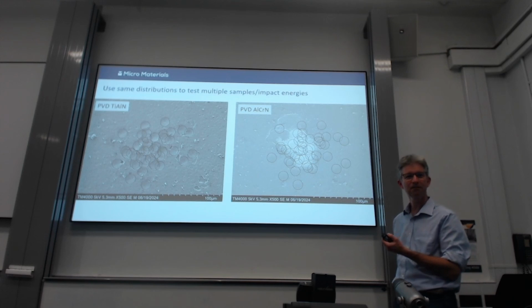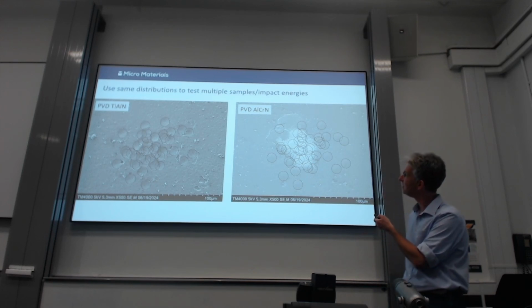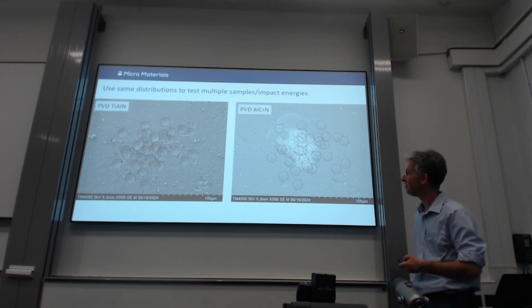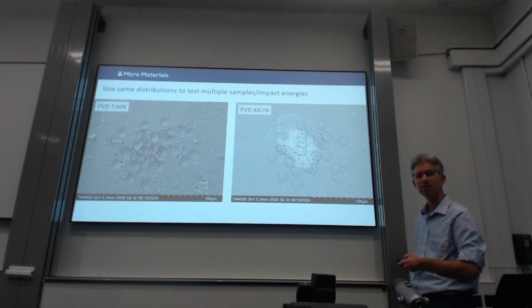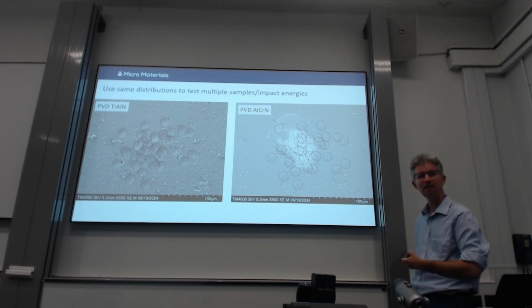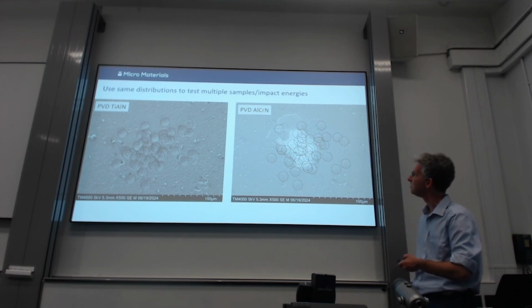So completely different. And what's absolutely fascinating about these coating systems is, in a cyclic test, this one is better. And it's not just a bit better, it's a lot better. So there is a lot going on in these things. The fact it's better in a cyclic test correlates with its machining performance. But this guy, you'd expect, has different mechanical properties, higher H cubed over E squared. You'd expect it to be better in erosion, and in our test it is. So I think there's a lot potentially going on.